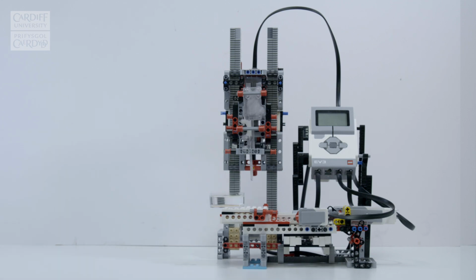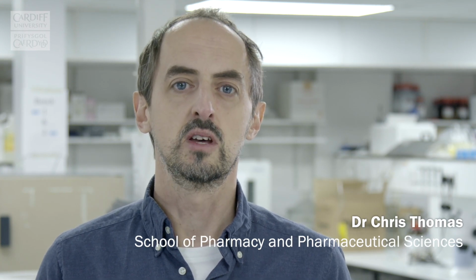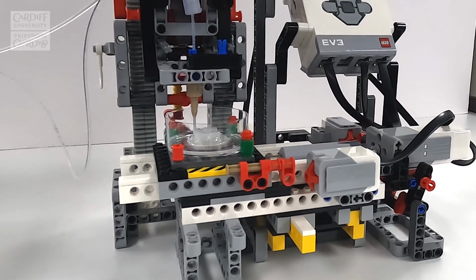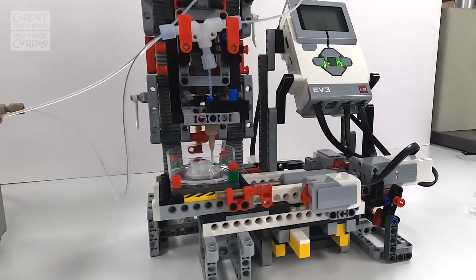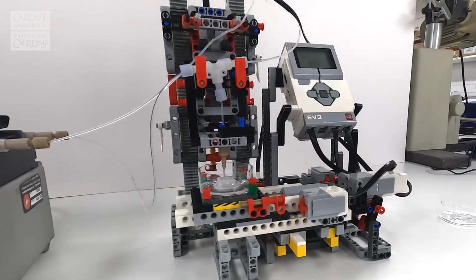Commercial 3D printers cost upwards of tens of thousands of pounds, and our initial idea was to develop a 3D bioprinter which was a lot cheaper and accessible to many research labs, not just ours. The idea came through, again, discussion with a research group that we could use a very accessible material, and that material was LEGO.